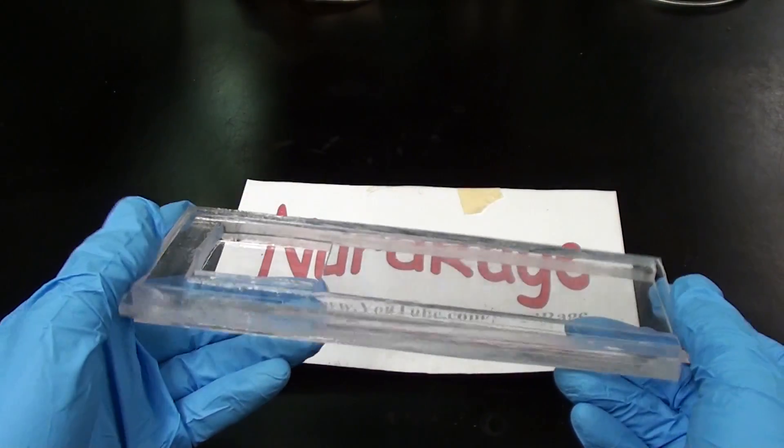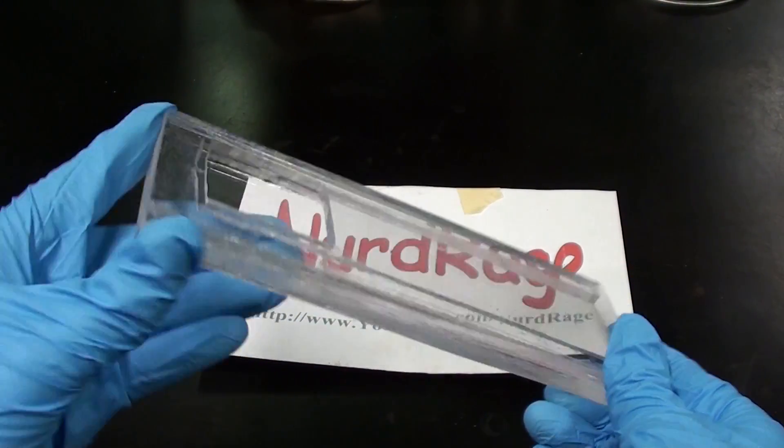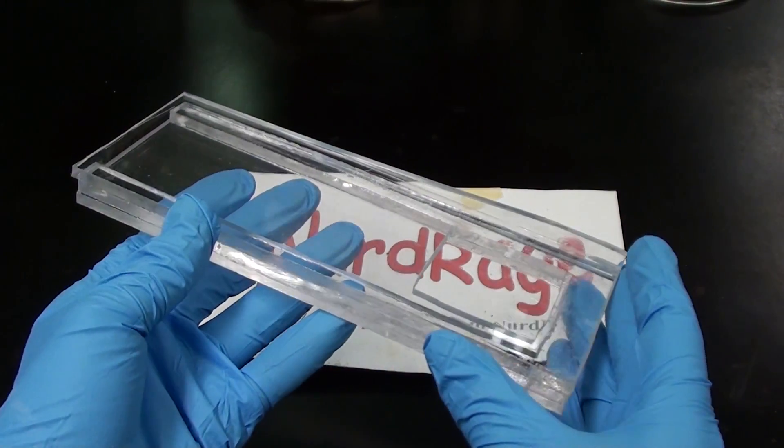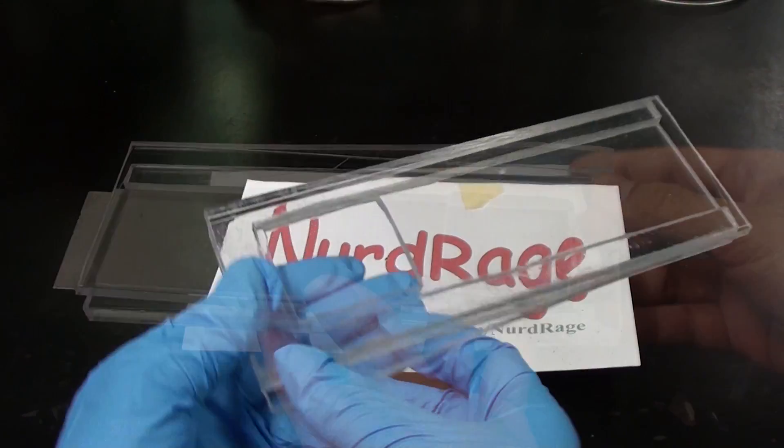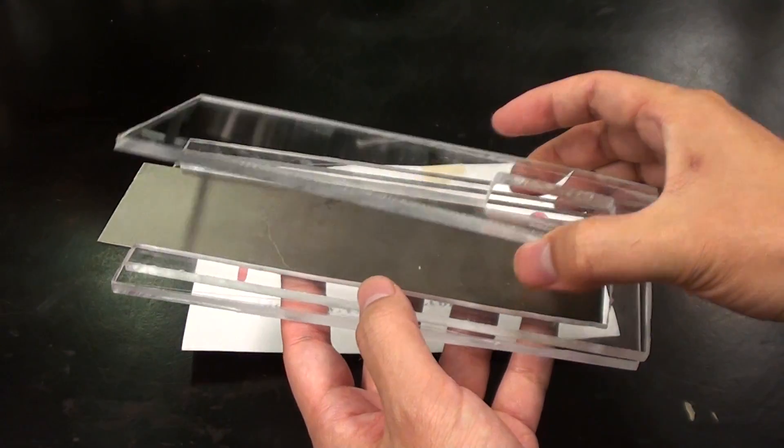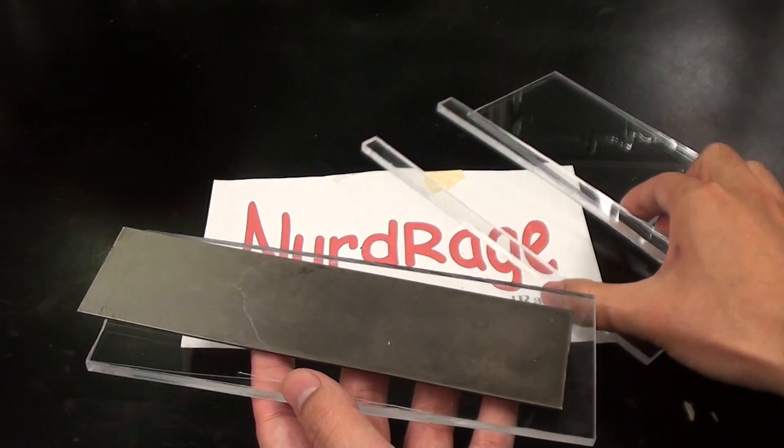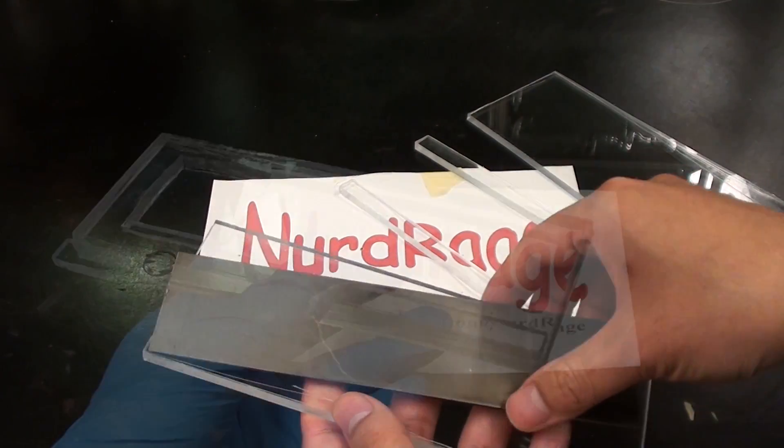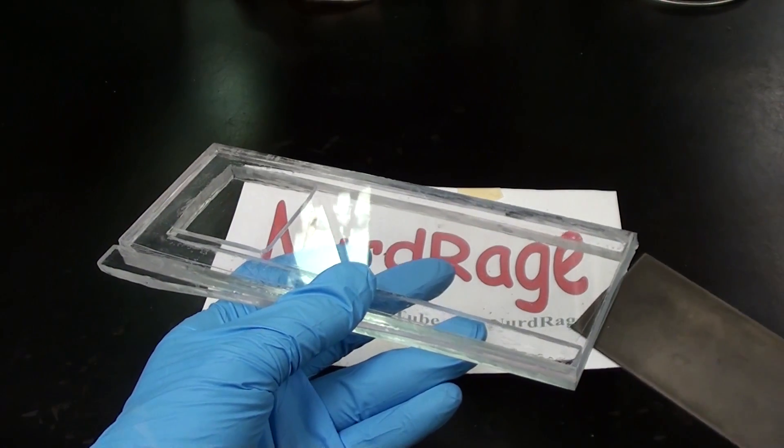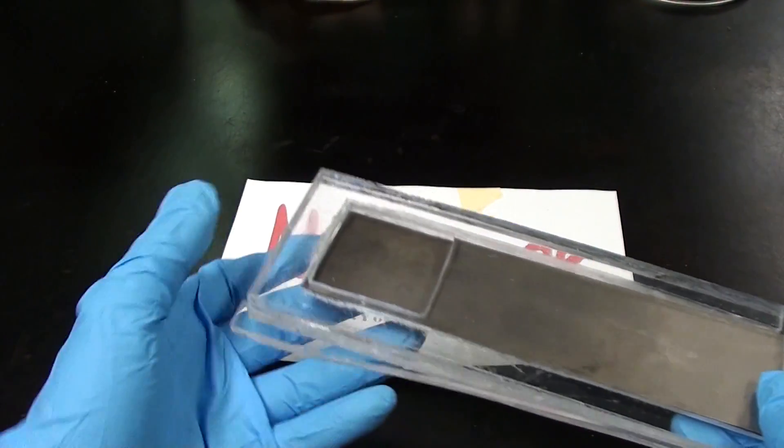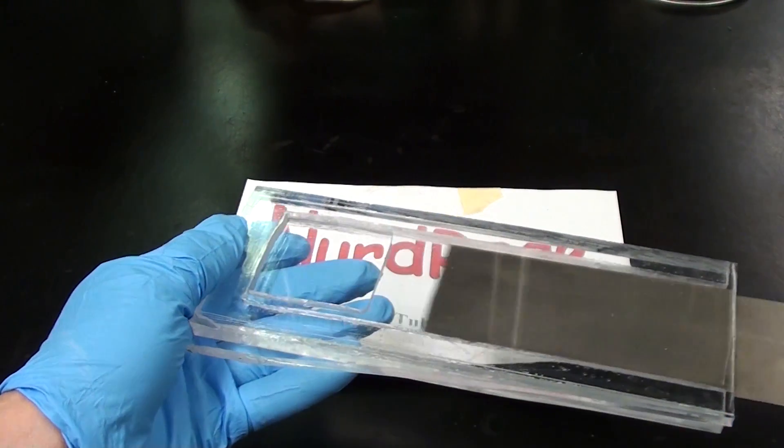Unfortunately my camera didn't properly record that part but it's very easy. You just put drops of dichloromethane or tetrahydrofuran solvent between the acrylic surfaces and they'll bond fairly easily. There are plenty of YouTube videos on that process already. Look up acrylic solvent bonding. Let me just test to make sure the electrode still fits. And it looks good. I'm going to cut and trim down the excess bits since we're almost done here.